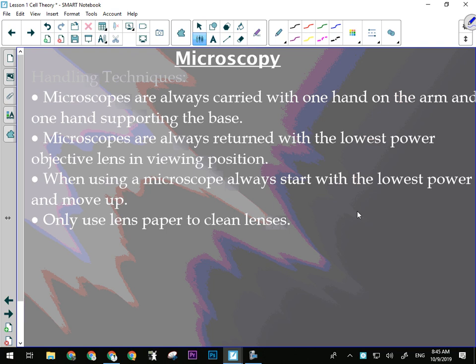Yeah. So, luckily for you, technology has improved vastly. All you have to be able to do is really take a picture through the microscope with your phone. It takes a little bit of practice, but in the end isn't too bad. And then just label the picture that you took, because that's way better than most of us are going to be able to draw of what we saw. So, I'll show you how to do that. It's pretty straightforward. And then we'll look at the pre-lab stuff for the microscopy lab.